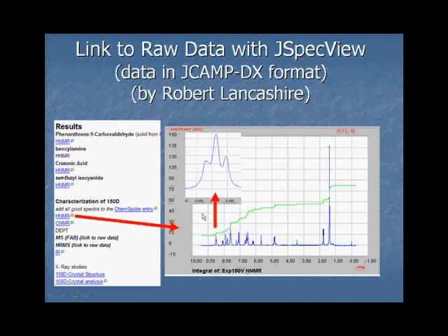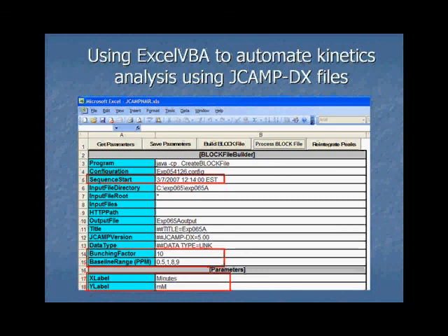I know a lot of you are probably annoyed. You want to find out what the NMR looks like, and you get this PDF that was scanned, and you can't tell what the peaks look like. But if you actually have the raw data in JCAMP format, you can easily expand this little peak and see that yes, it is a triplet, and you can measure the coupling constants, or you can do whatever you want with it. And that's really, really important. If you're making statements about things, people have to be able to verify your raw data. They have to be able to make the same conclusions based on the same information. And JCAMP is really a nice little format to use.